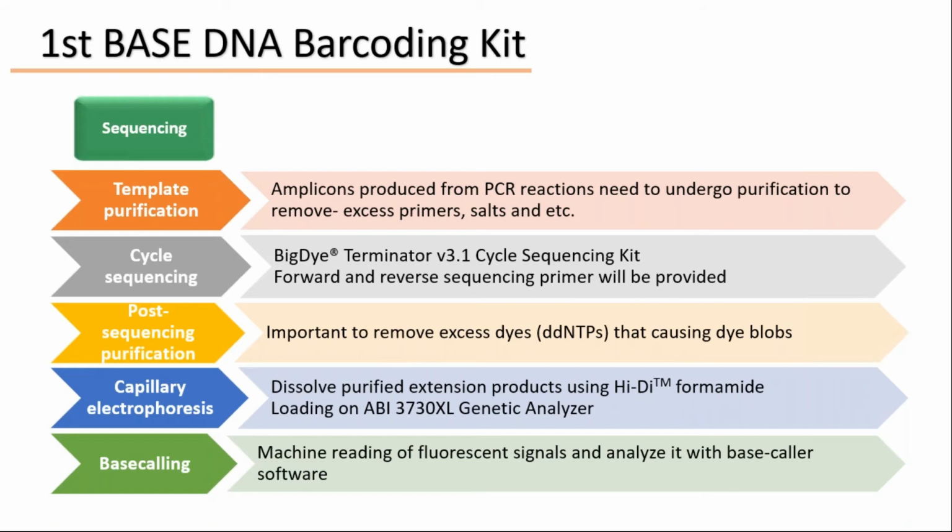Lastly, we will use the base caller software, which can give you the quality value of each base call. The final part is quite important for the bioanalysis.